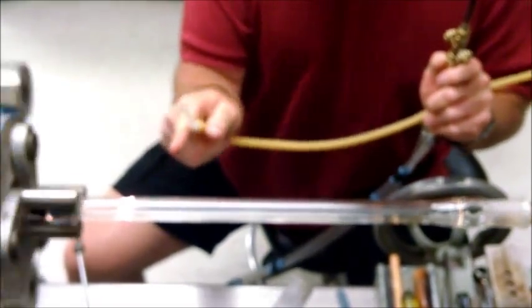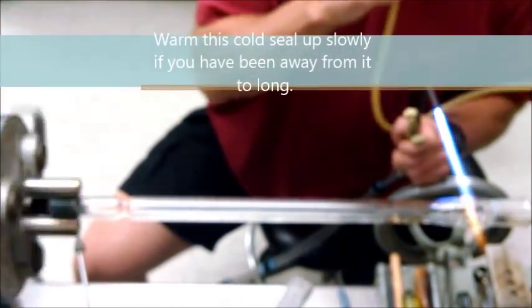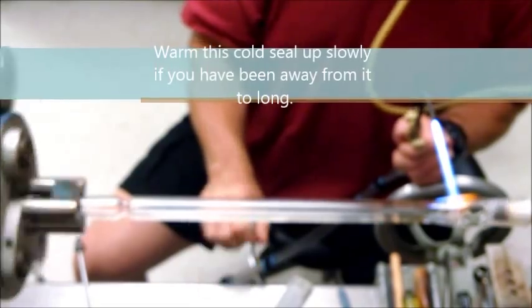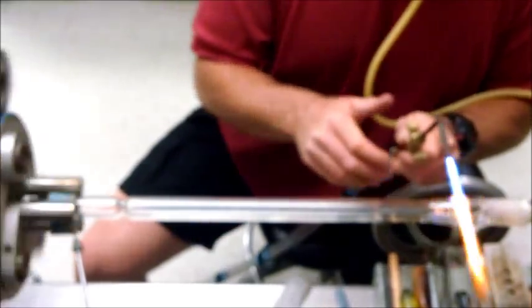Now there's a ring seal on this side, there's still a hole right there. Get that hardened up. All right, by now I'm going to work this in.